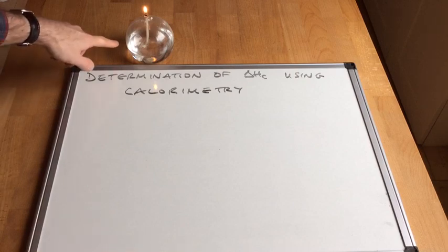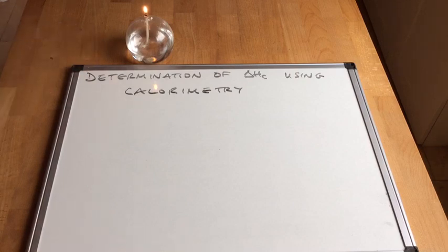So I've got a spirit burner here that's got some propane-1-ol in and it's burning away there, it's combusting, it's reacting with the oxygen in the air and the calorimetry method can be used to determine a value for the enthalpy change of combustion for this reaction.